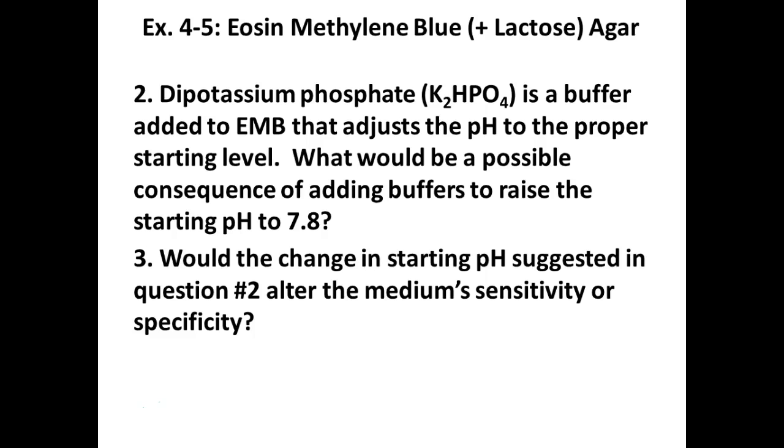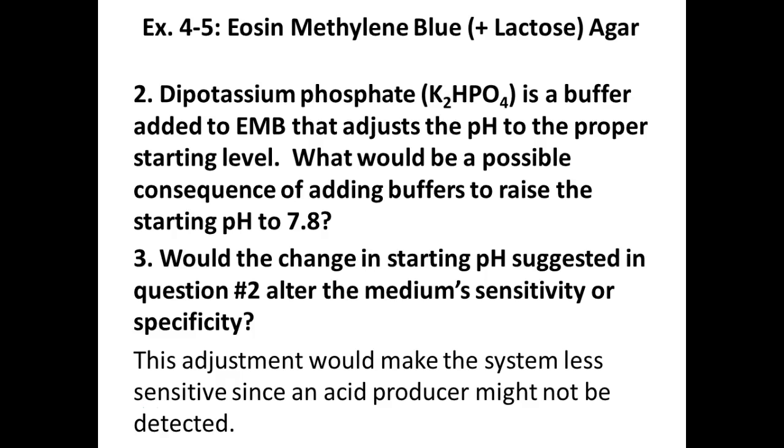If someone messed up the pH of the media, would this affect the media's sensitivity or specificity? The pH. Sensitivity. Again, it's going to make it hard to tell the color changes and be accurate if the pH isn't in the right range.